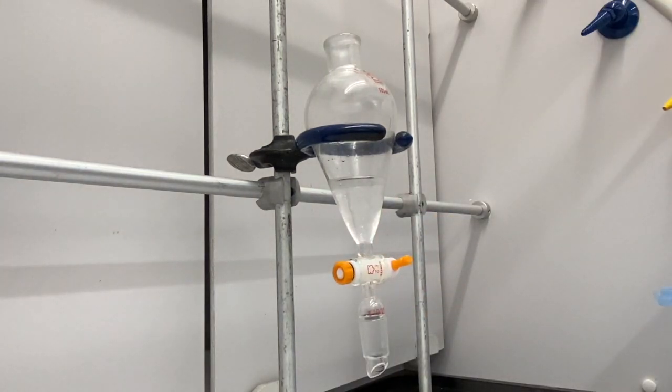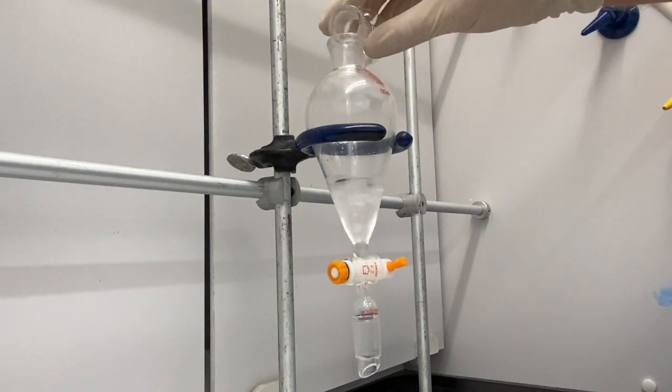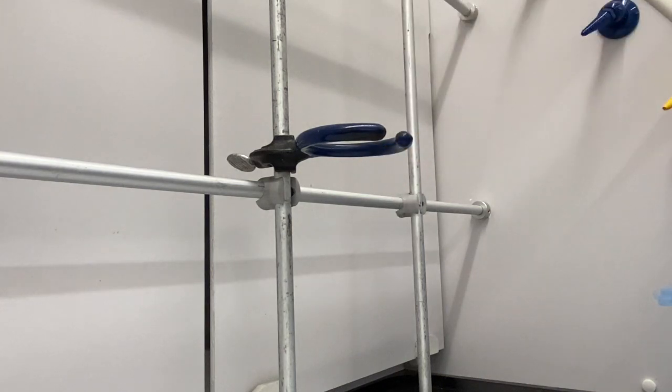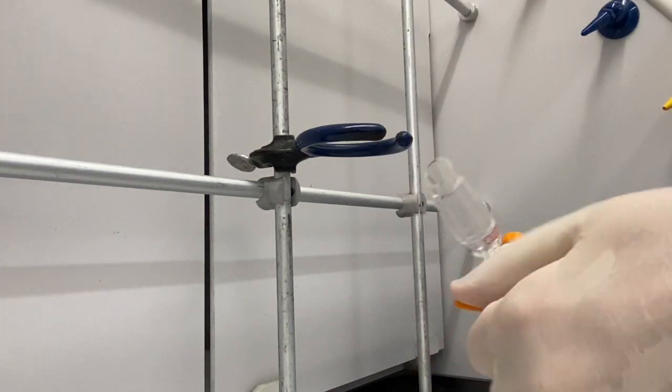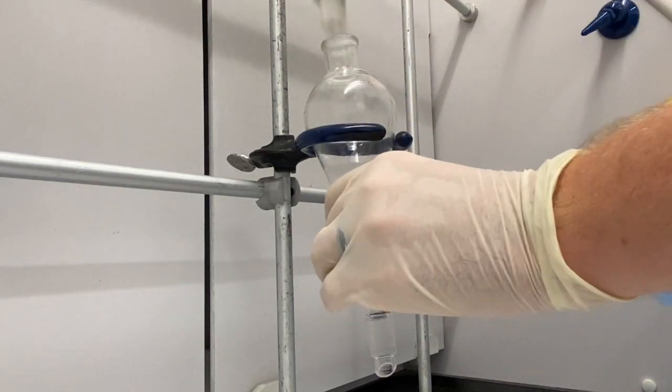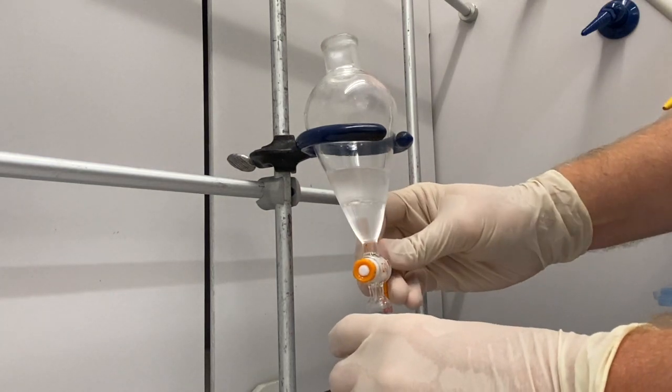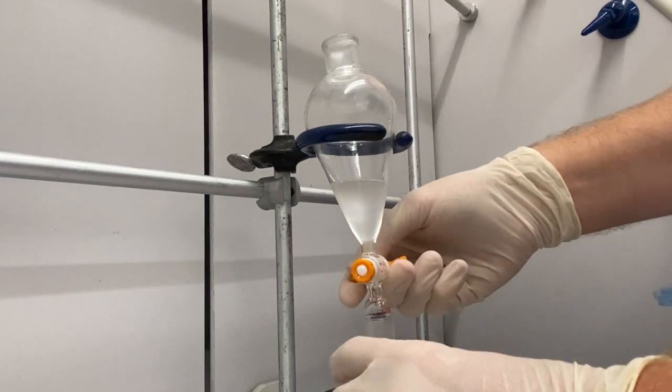There you go. So then we'll do the extraction again. I'm going to rinse out our flask, add that till I have a good layer, and then shake it up again. Vent, take off the cap, and let the layers separate. We'll drain out the bottom layer with that first extract that we had.